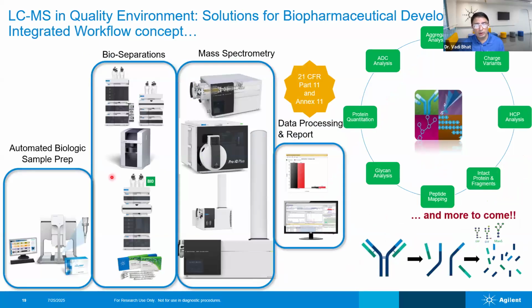Now, when you look at the mass spectrometry based characterization of monoclonal antibodies or any proteins, peptides, or other molecules, you need sample preparation, either manual or automated, followed by separation, either by chromatographic HPLC based methods or capillary electrophoresis based methods.